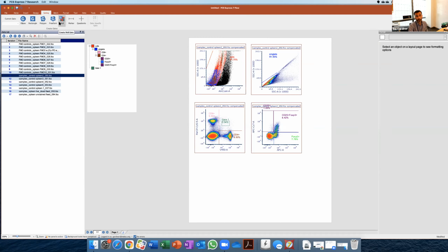Then once you start the experiment, you have most of the things troubleshot, understanding that there will always be some differences between different tissues, and then just working as carefully as possible not to lose cells.